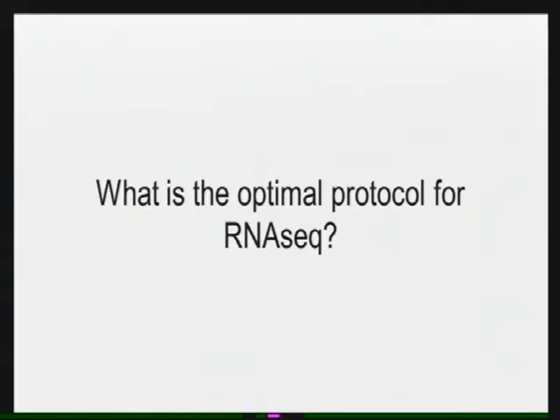Right. So if it's RNA-seq, I usually look at the alignment rate. I look at the fraction of genes that are detected across all the samples. I look at the fraction of biotypes, how the reads are allocated to the different biotypes, like how many are protein coding, how many are pseudogenes.